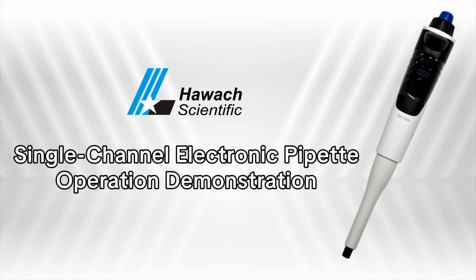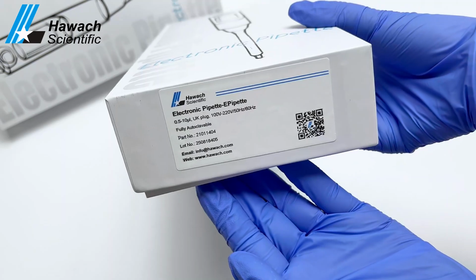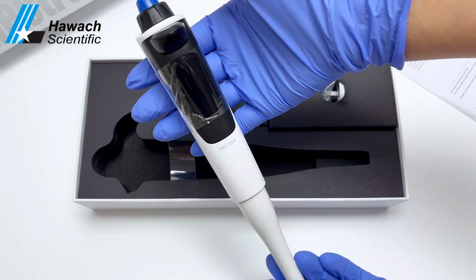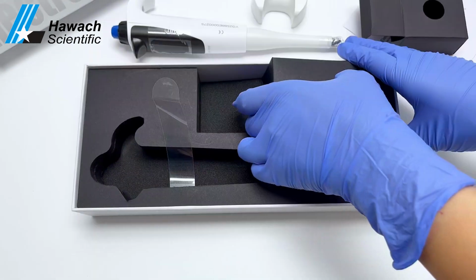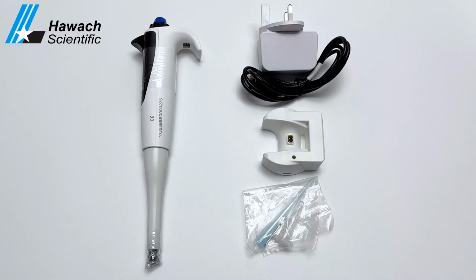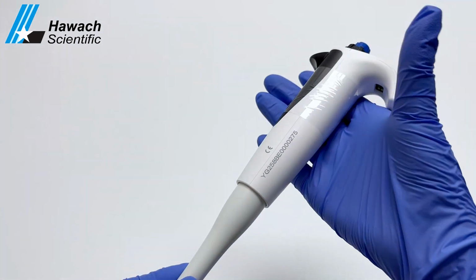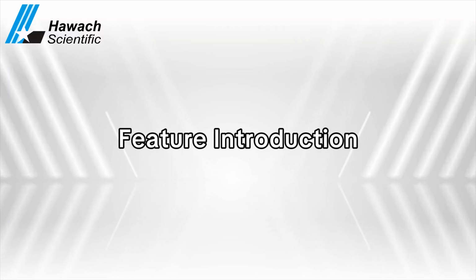Single-channel electronic pipette operation demonstration. Feature introduction.